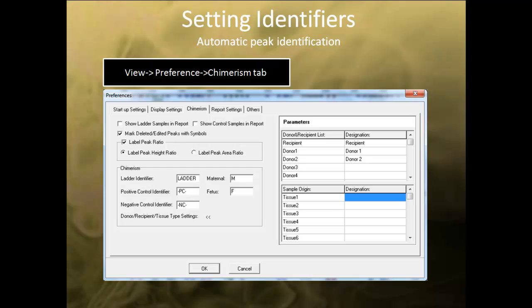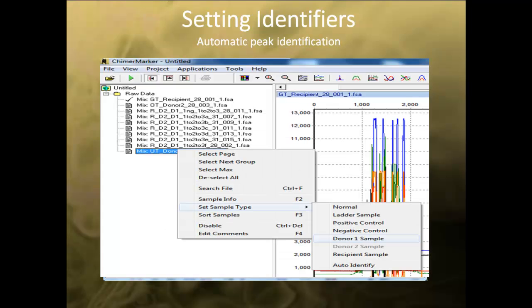After importing the data, go to View, Preference, and select the Chimerism tab. You must specify the identification for donor 1, donor 2, and recipient as previously discussed with single donor data. You can also right-click on the sample in the main analysis window and select Set Sample Type to specify the identifiers.